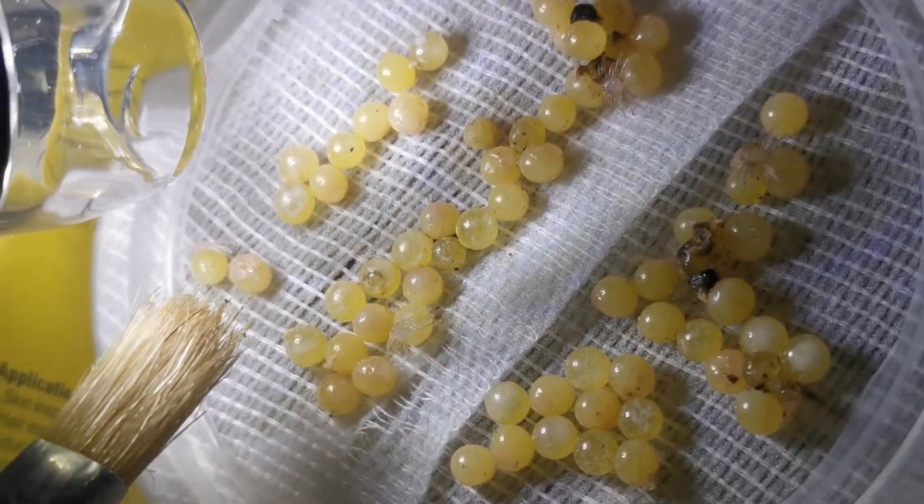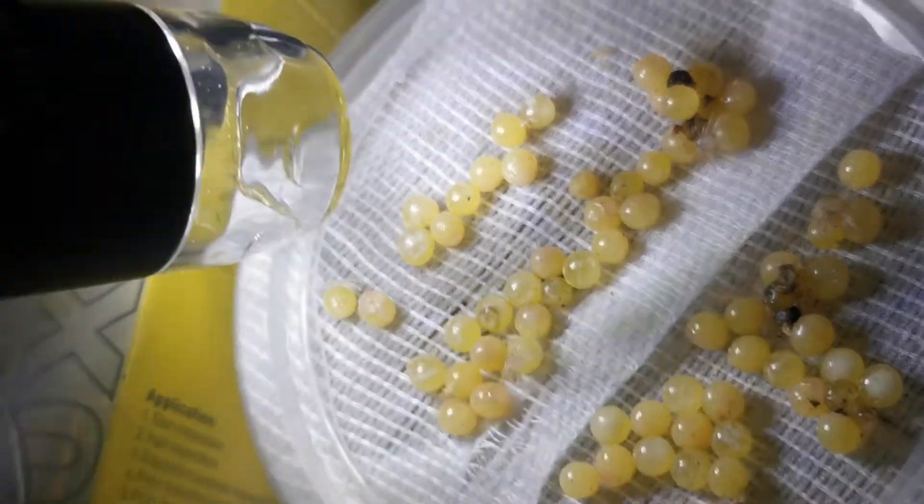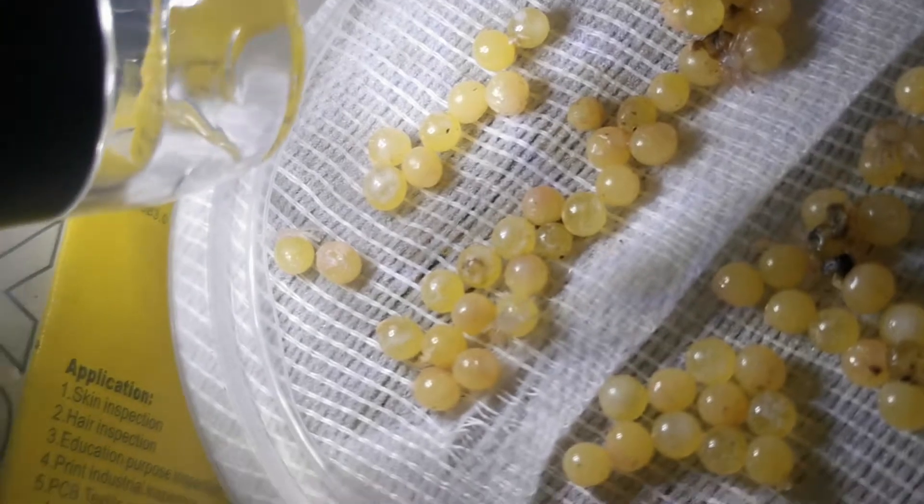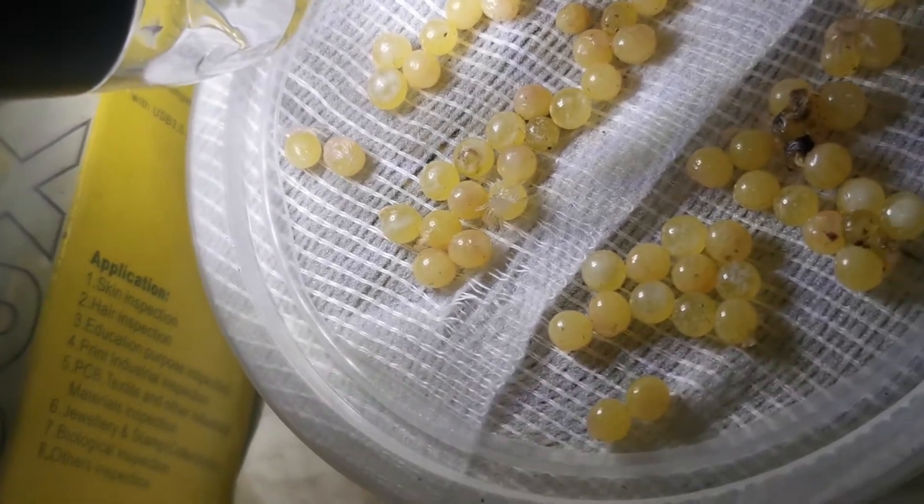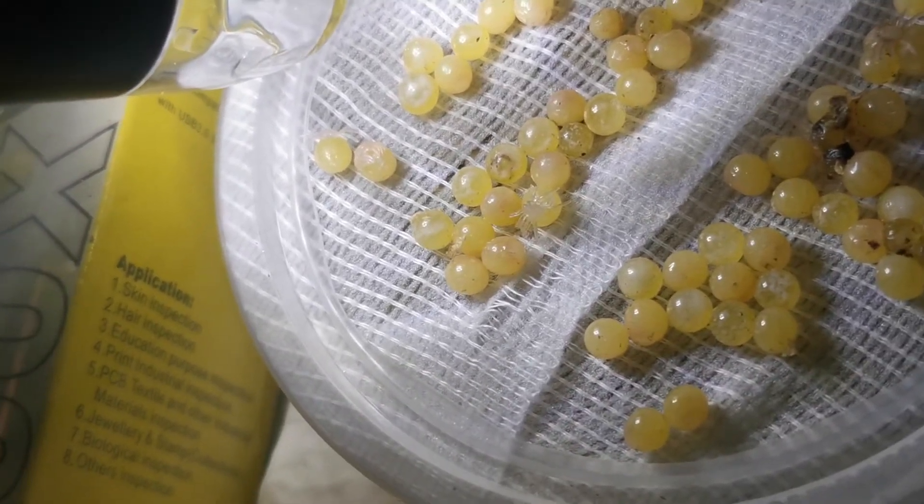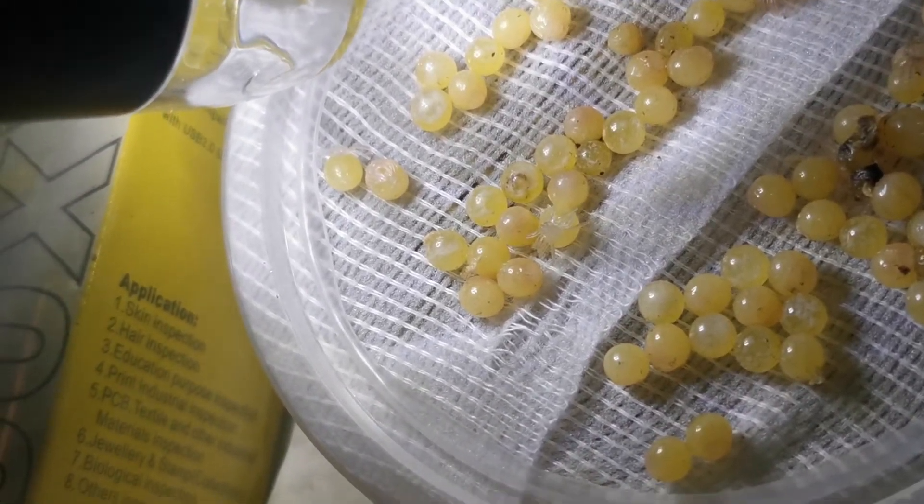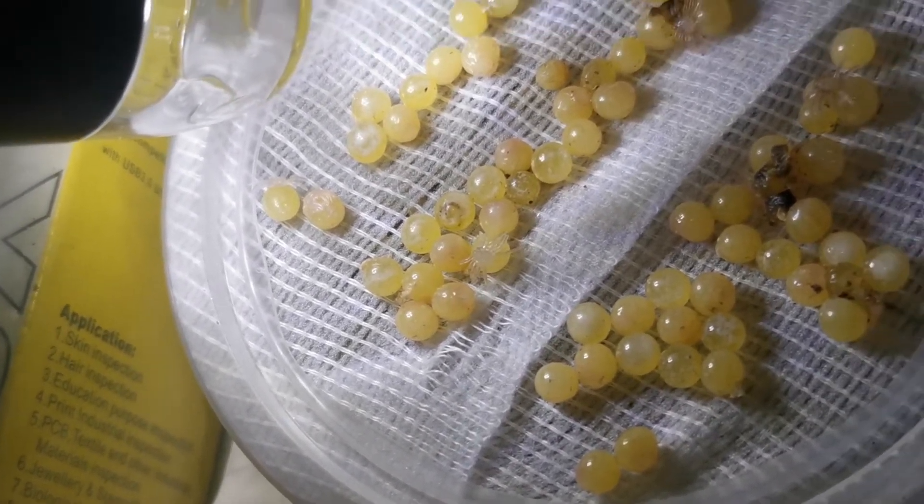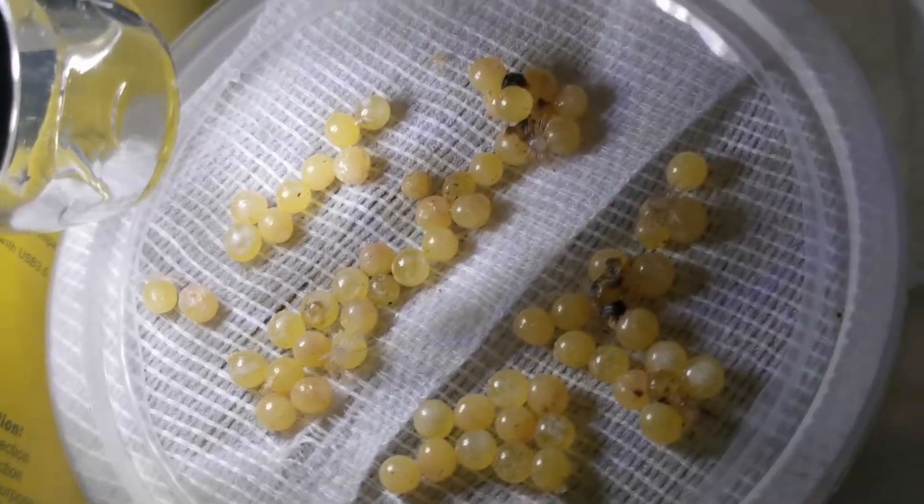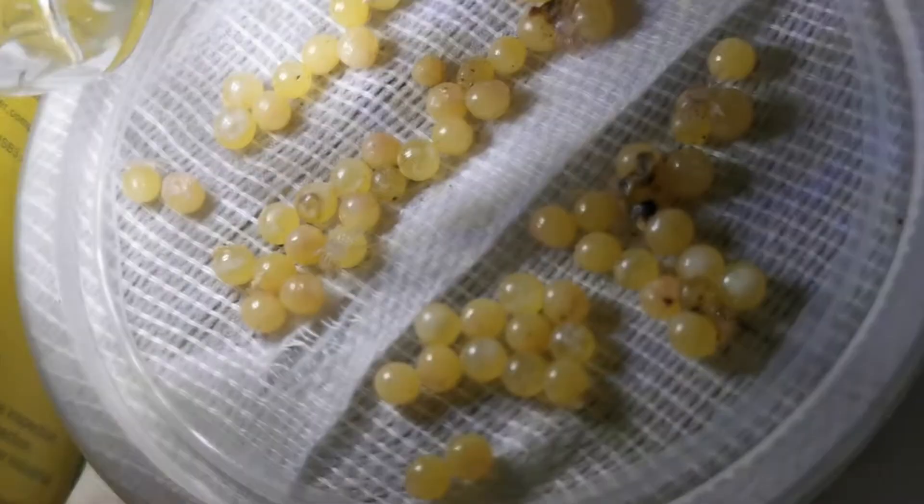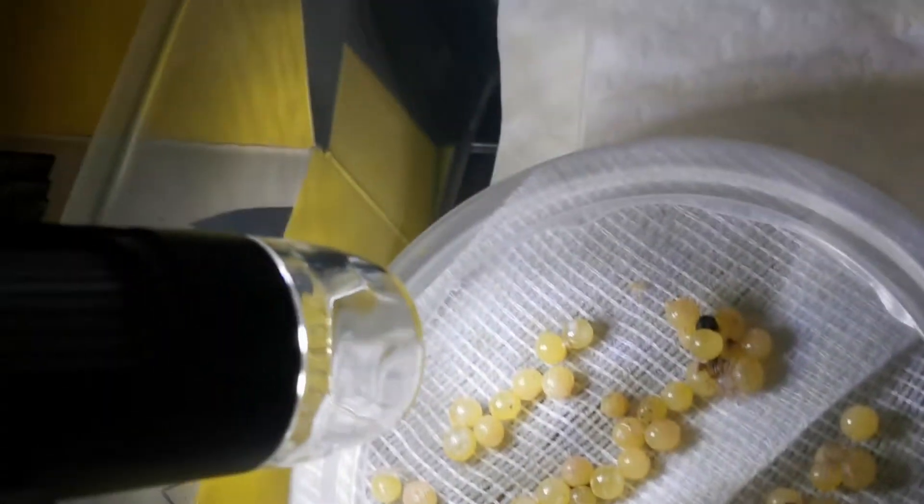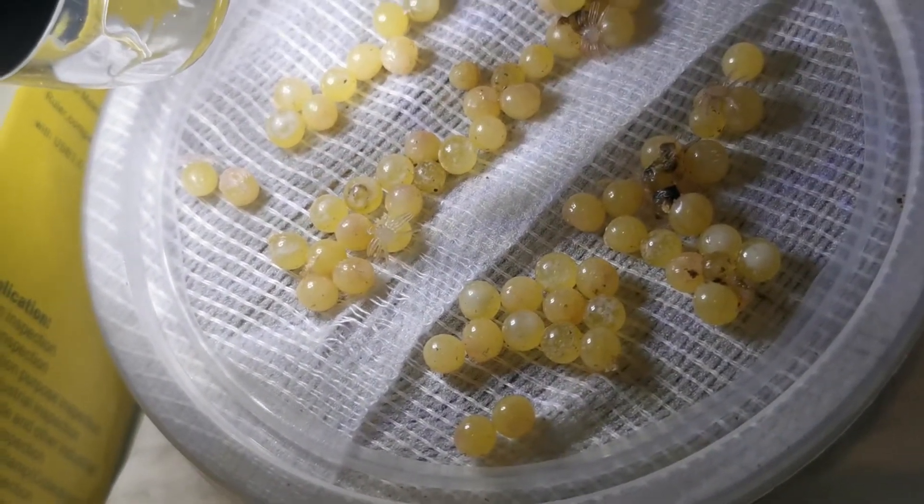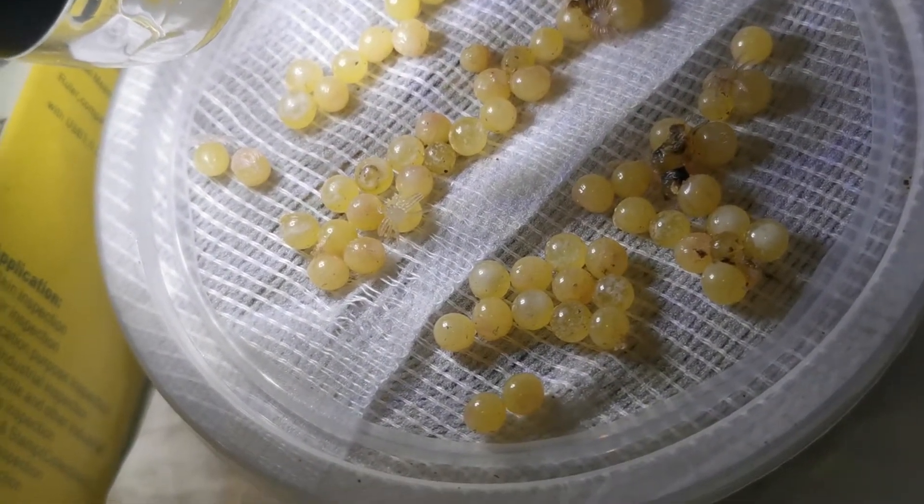And then this one there as well. I'm going to try and zoom in so you can see that's actually this part itself developing, the legs coming out, and then it will start to shed. There is a tiny shed you can see there. Let me quickly try and zoom in here and show you guys.